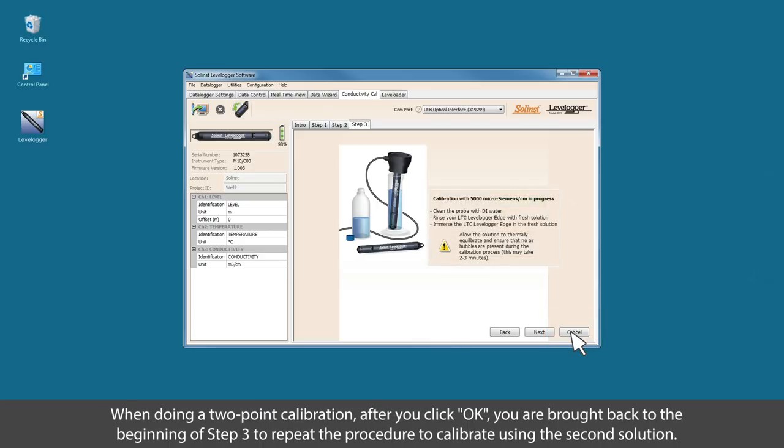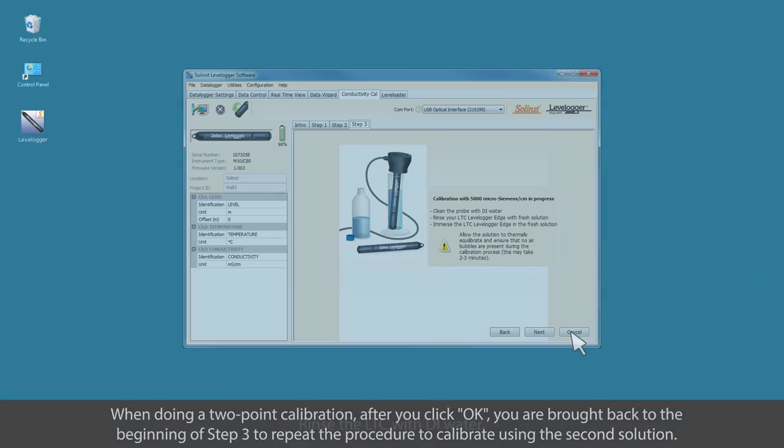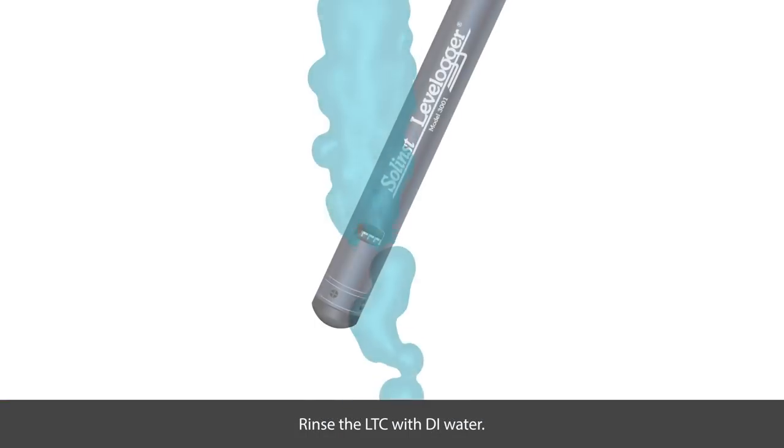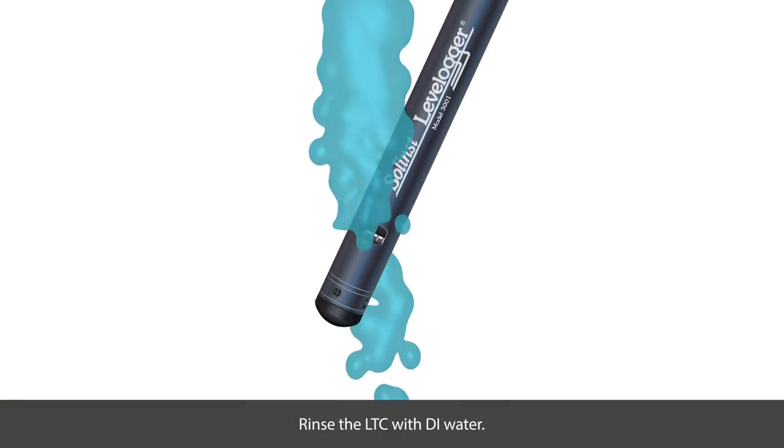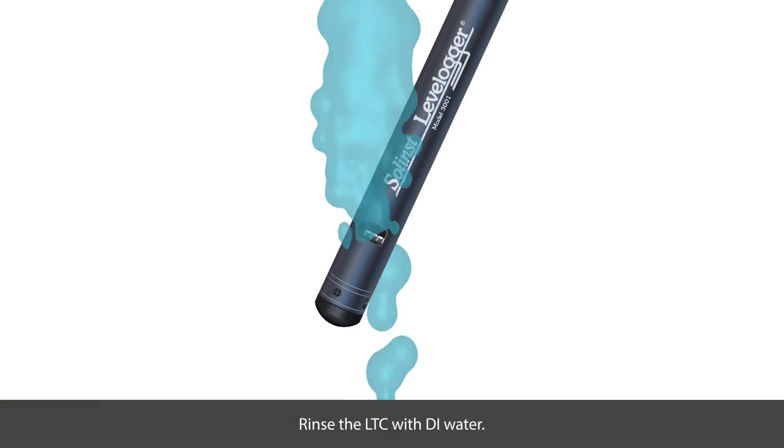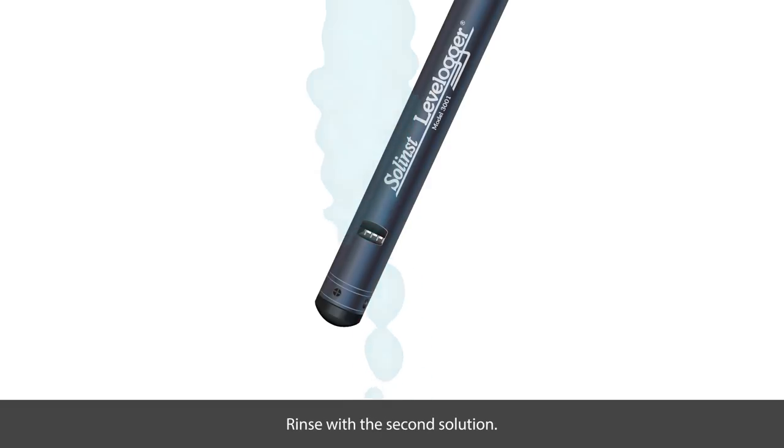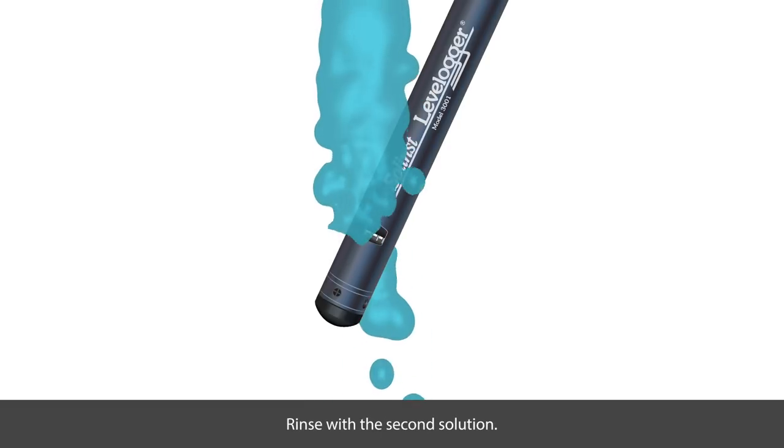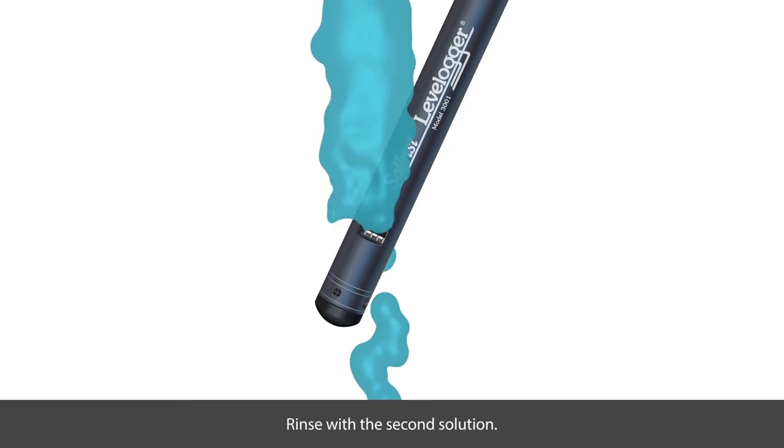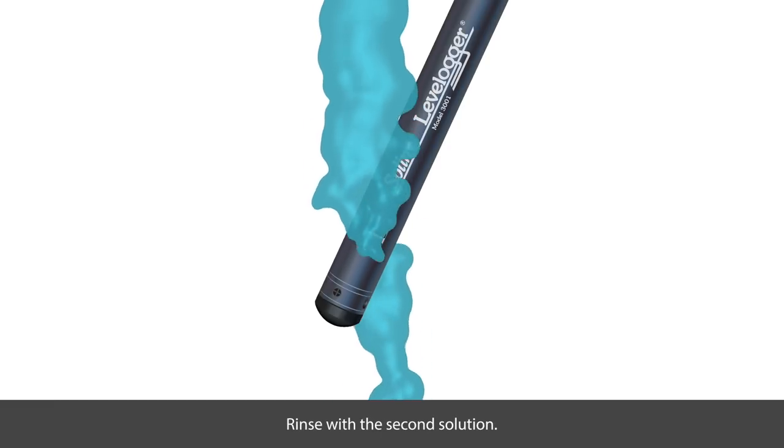When doing a two-point calibration, after you click OK, you are brought back to the beginning of step number three to repeat the procedure to calibrate using the second solution. Rinse the LTC with distilled water, rinse with the second solution, and then immerse the LTC in the second solution.